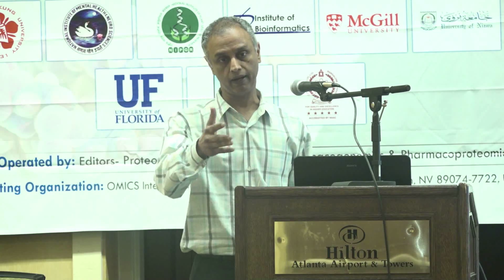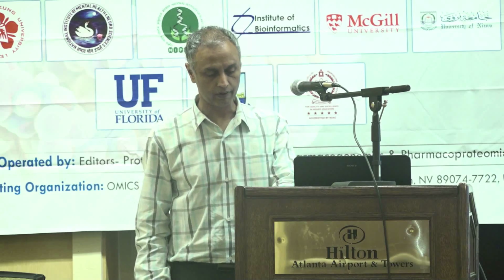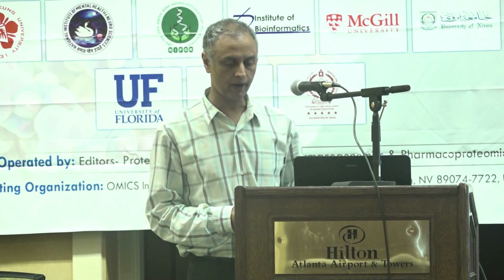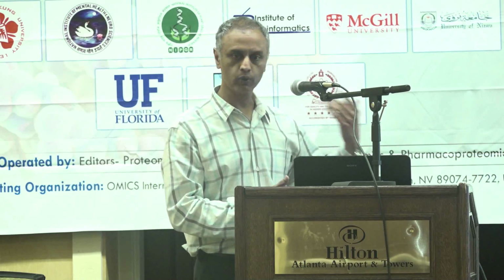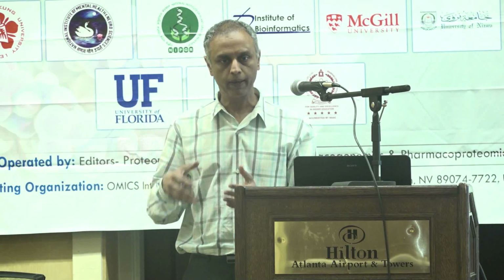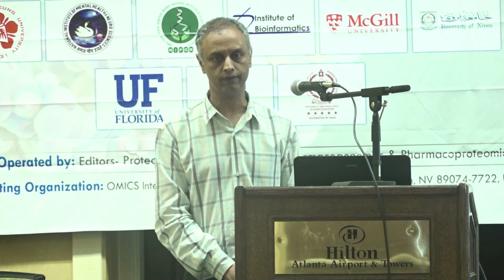An example is we had a collaborator, and I was talking to Dr. Ravi Kumar also. He came to us because he wanted to identify a fungal pathogen. And that fungal pathogen was not in the database. So we said, we will do discovery proteomics where we don't rely on the library, but we basically can sequence multiple peptides and can tell you which fungus it is.